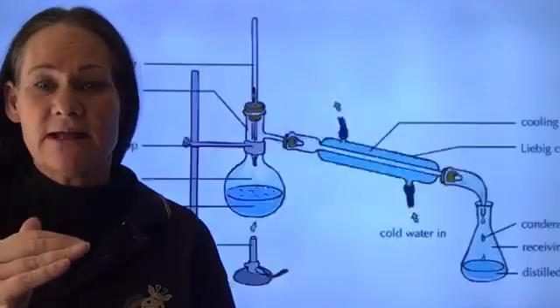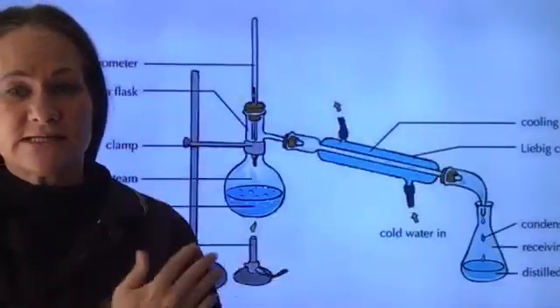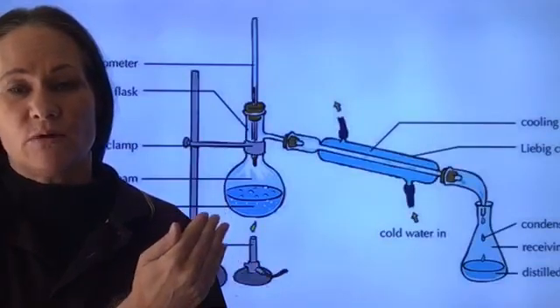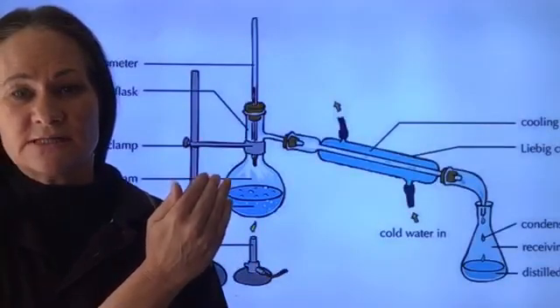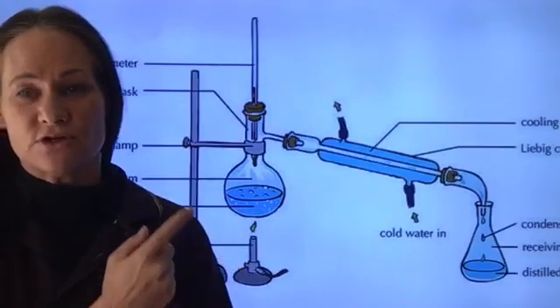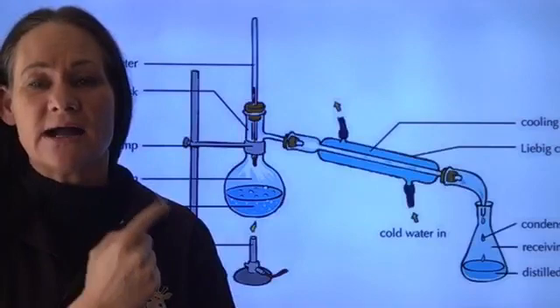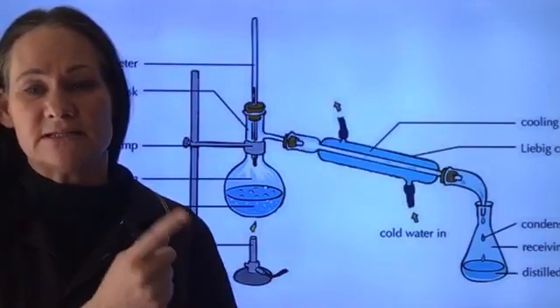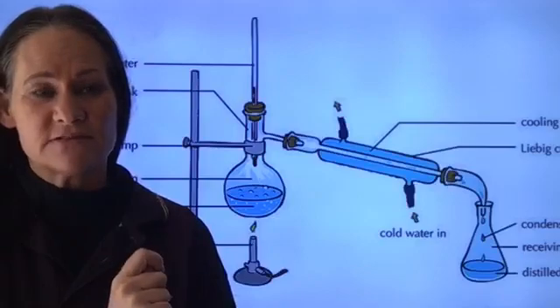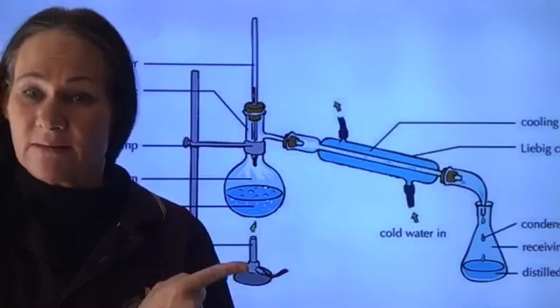will then boil and it will go through a whole process, the distillation process, where the ethanol will evaporate first and run down the tube and the water will remain behind. So through the process of distillation, I can separate two liquids. My determining factor in that instance to use that physical method of separation would be its boiling point. Let's do some experiments.